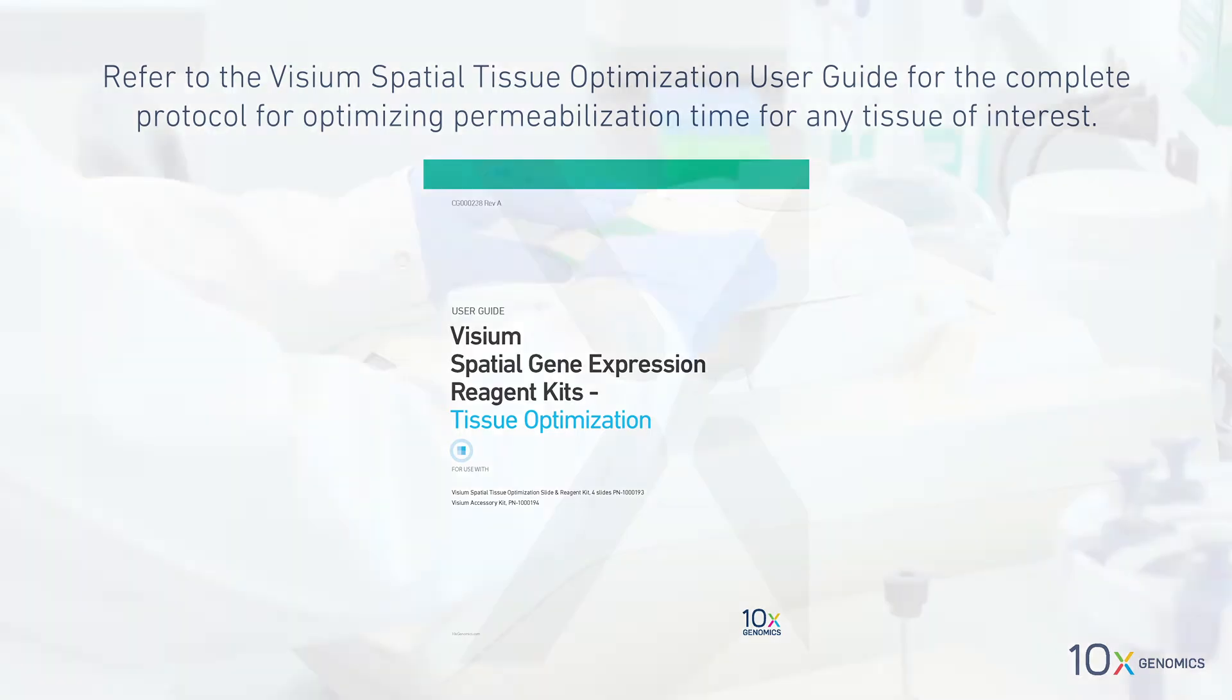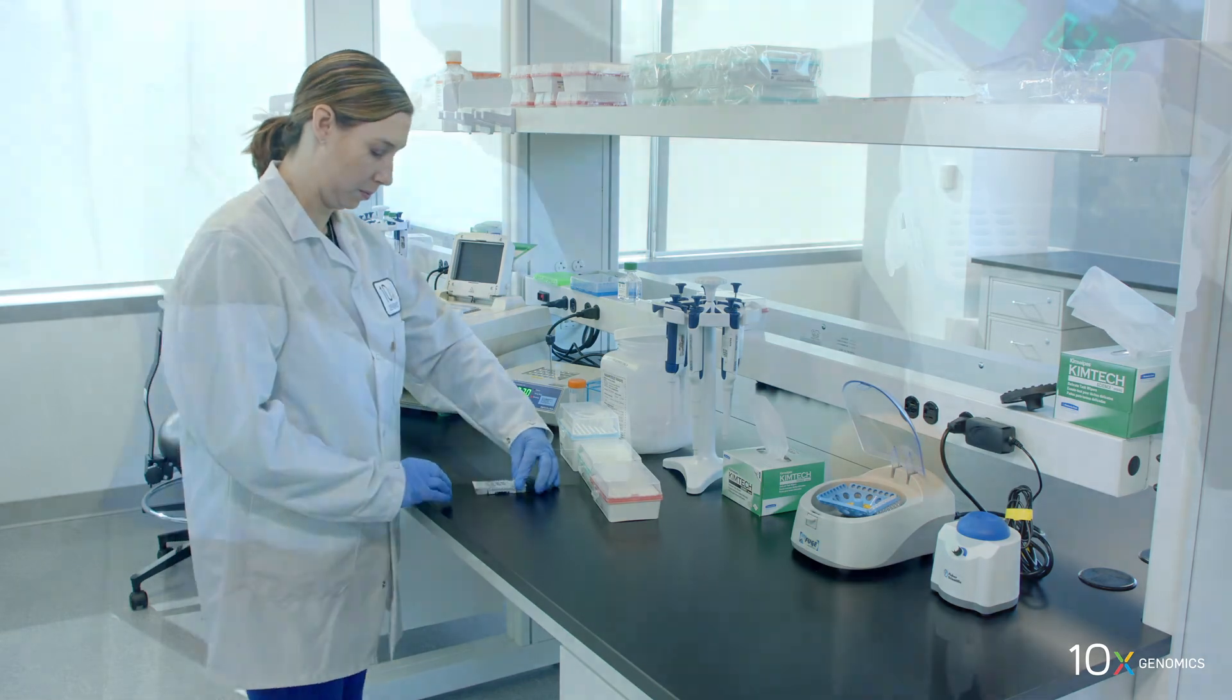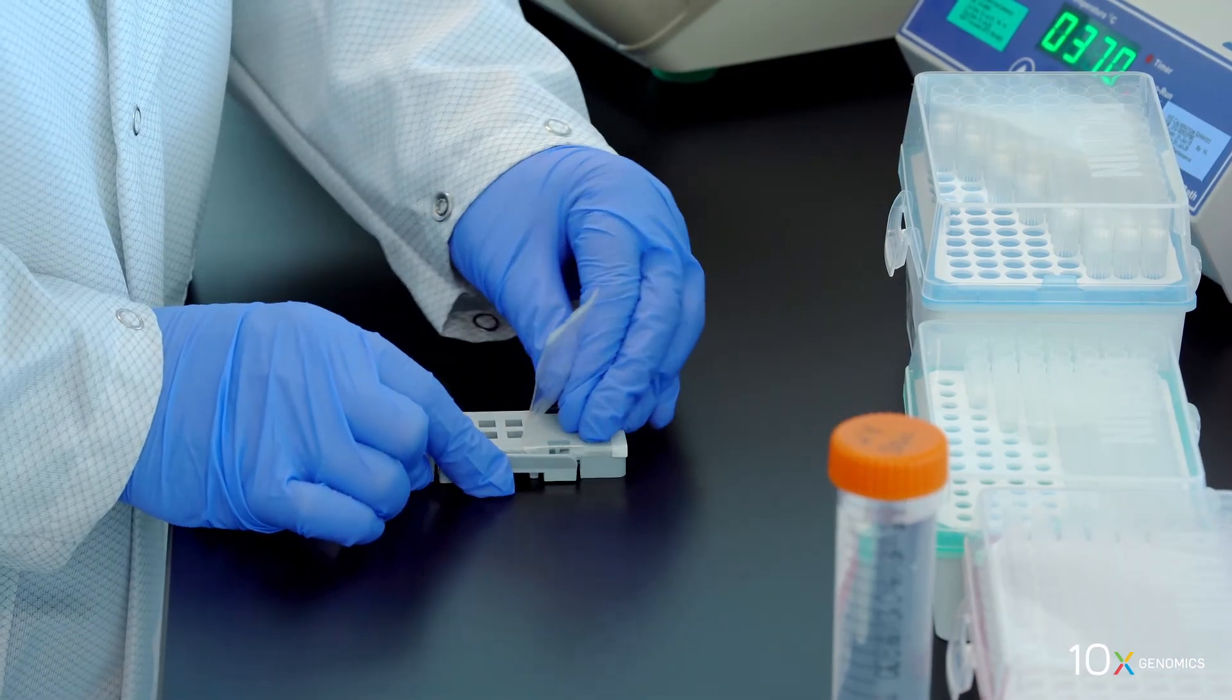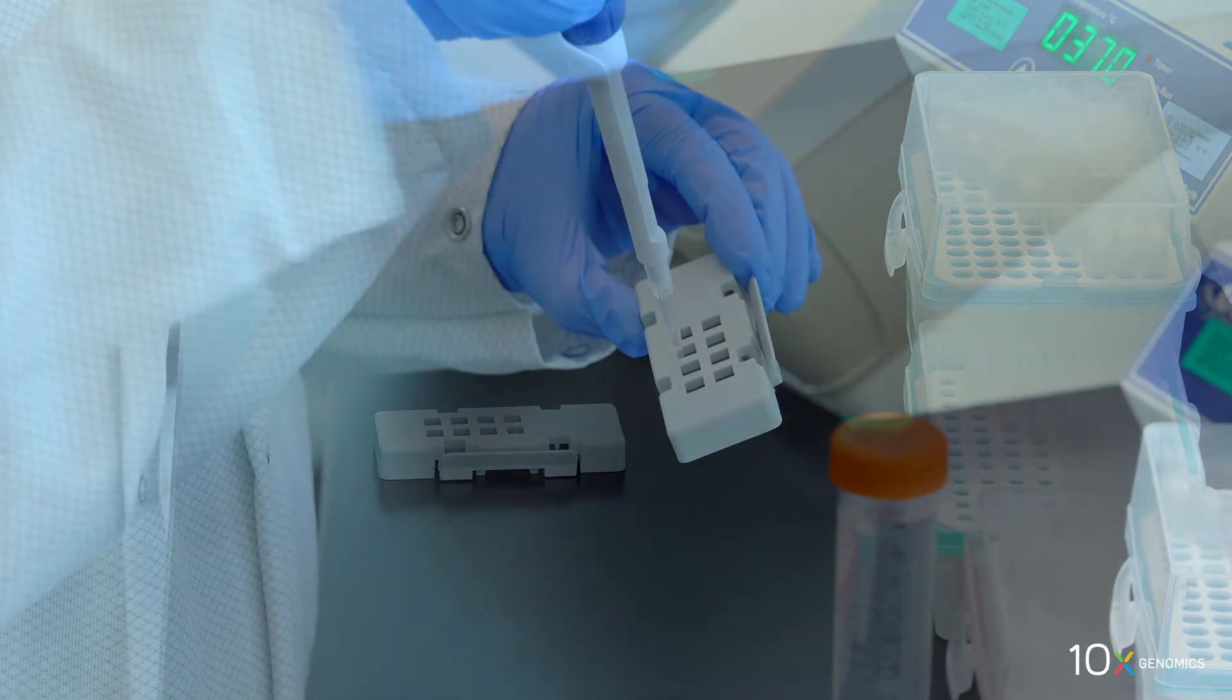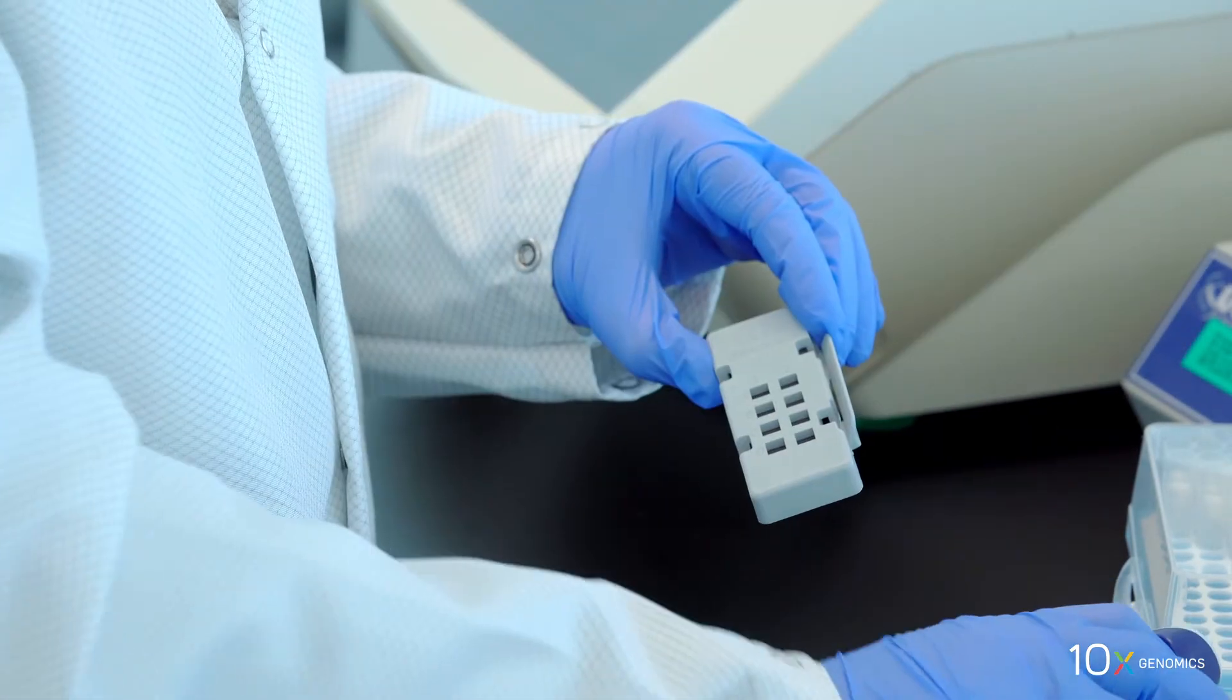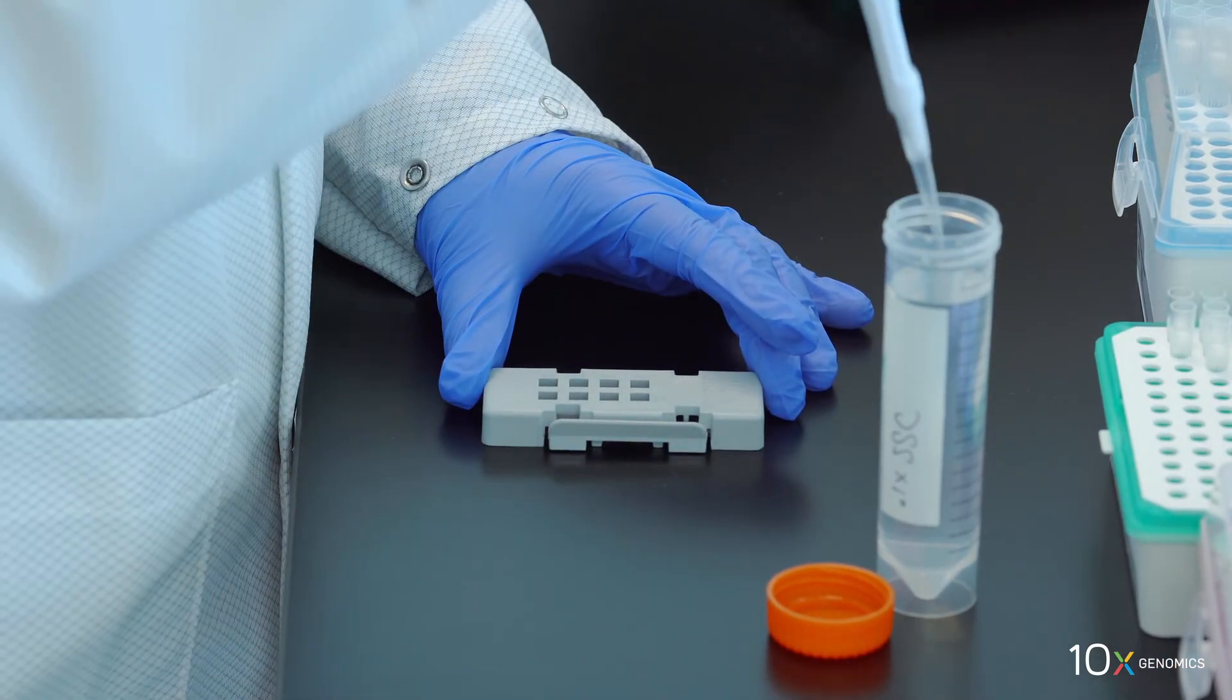After the incubation time has elapsed, remove the slide cassette from the thermocycler adapter. Remove the slide seal by pulling from the edge while firmly holding the slide cassette with one hand. Ensure that no liquid splashes out of the wells. Remove permeabilization enzyme from the well corners. Add 100 microliters of 0.1x SSC to the wells.